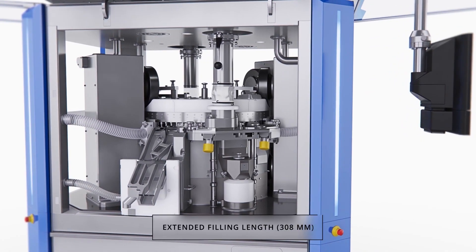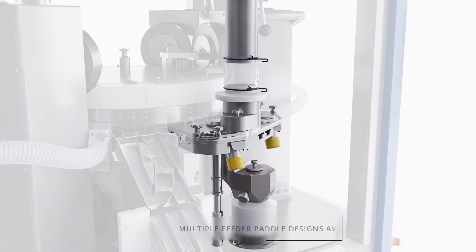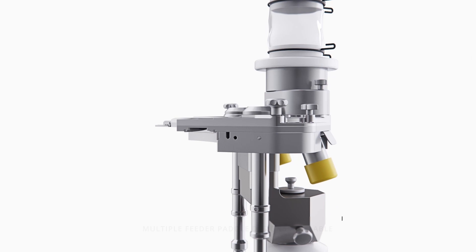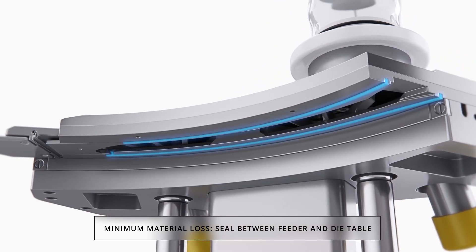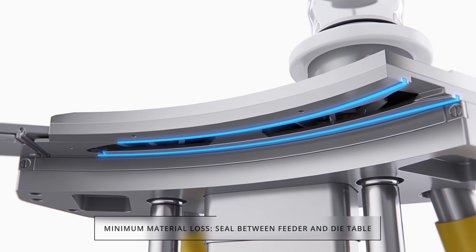The XT600 offers an extended feeder length to maximize the filling dwell time. The closed feeder design and unique sandwich seal ensure a clean die table and superior production yields.